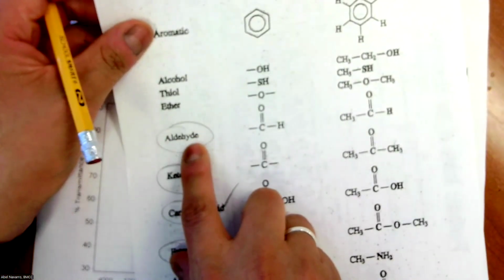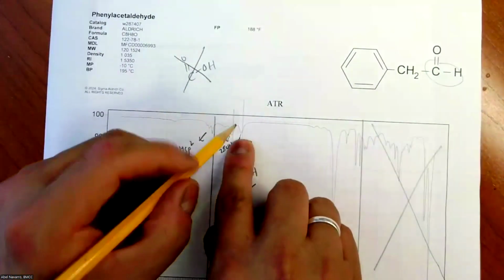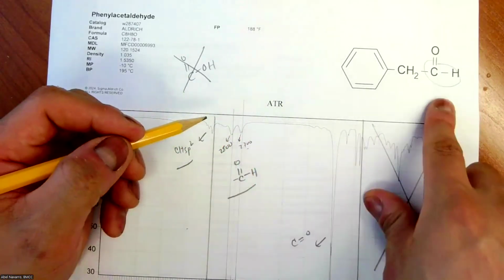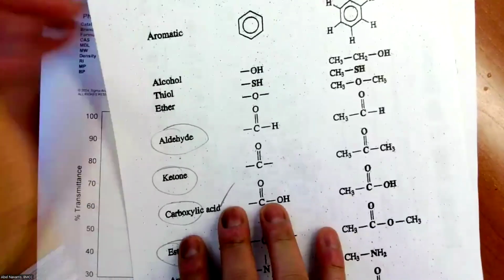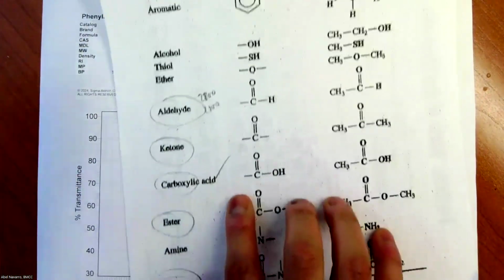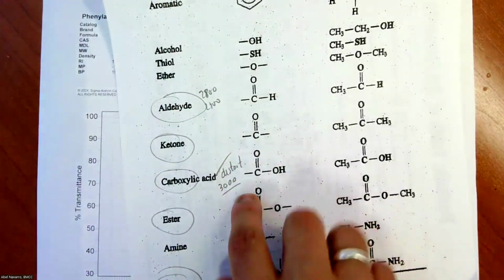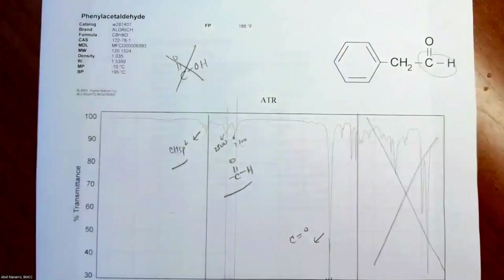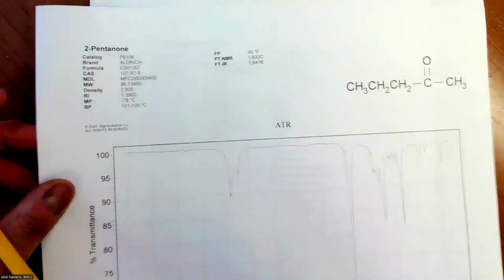Now, the next one is aldehyde. How can I know that my C=O is an aldehyde? Because I will see those two humps, 2800 and 2700. That's how to determine if this is an aldehyde: I need to see something at 2800 and also 2700. What about the carboxylic acid? Distortion around 3000, that's how you will know. Ketone is the basic one, the one that is unaffected. It's kind of like the standard.